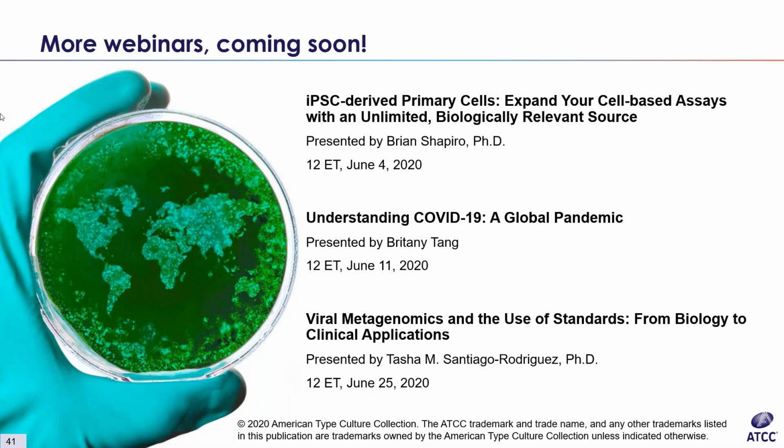Okay. Question number 2 around proliferation assays. What is the best, MTT or XTT, and why? Which between those two would be the best one? Yeah, and they say for cytotoxicity assays, if that makes a difference in your answer.